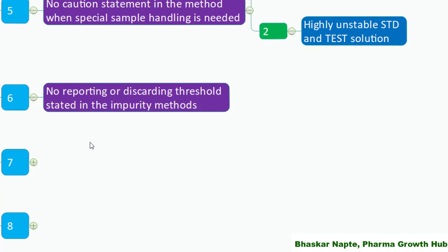The next point: no reporting or discarding threshold stated in impurity methods. It is very important to understand above which level you must start reporting results. To identify the reporting or discarding threshold, you can refer to ICH guidelines Q3A or Q3B. Clearly mention the limit of quantitation and detection limit of your method so the analyst has clear guidance on integration of impurity peaks — for example, below 0.05% all impurity peaks can be discarded.